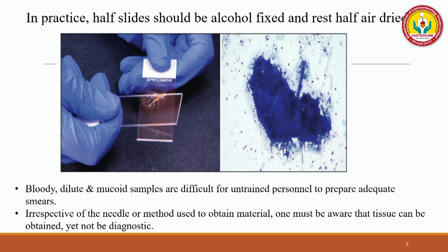And also how many slides to make and how to fix the slides. So in practice you can make air dried smears and you can make fixed smears. So fix one in the isopropyl alcohol 95% and the other you can take for air drying.